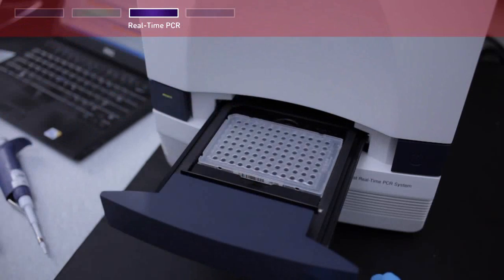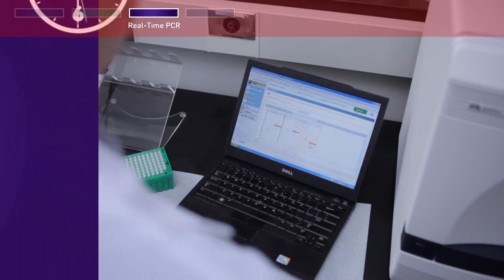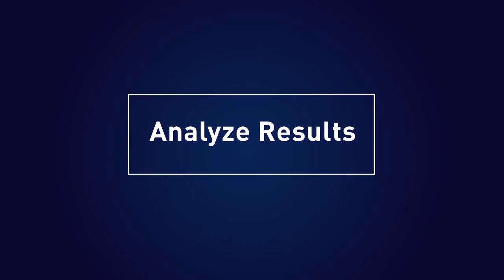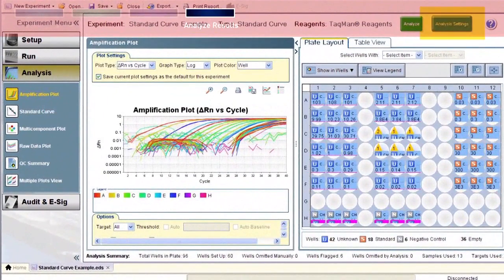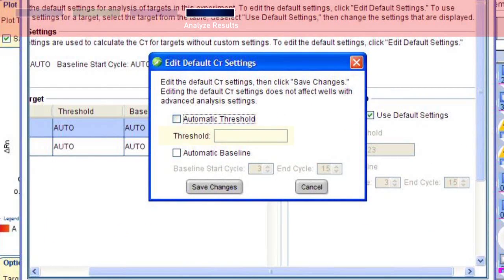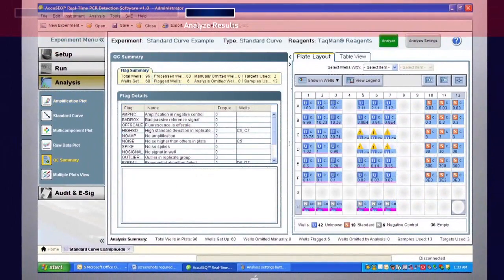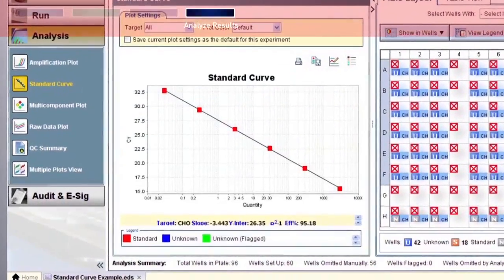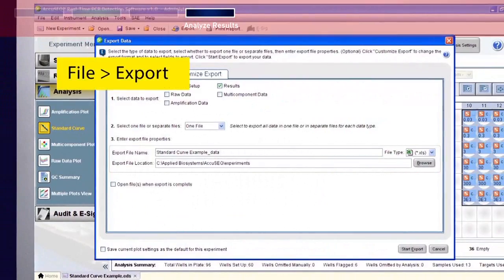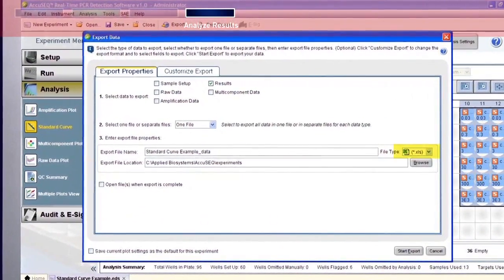Load the plate into the instrument and click Start Run. A residual DNA run is approximately 1.5 hours. The final step in this protocol is to analyze results. In the AccuSeq software, select the following analysis settings: in the analysis settings window, deselect automatic threshold and in the threshold field enter 0.2. Baseline may be run in automatic or manual mode, whichever best suits your data. Evaluate first with auto baseline by selecting automatic baseline, then review the data and analyze the flag summary. Verify the values for the slope, intercept, R-squared, and efficiency. To export the database, select File > Export, and in the export data menu select file type XLS, then click Start Export.